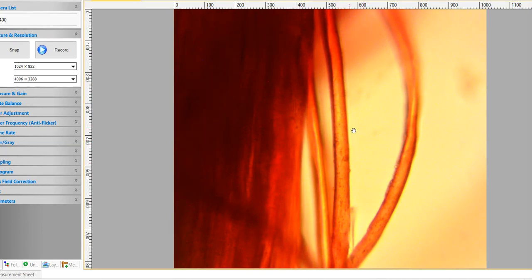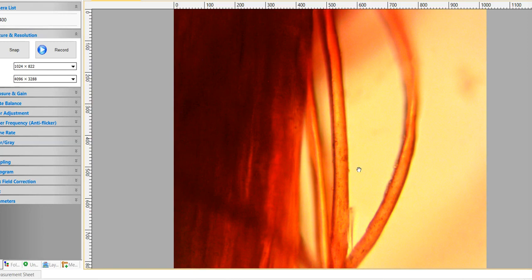And I believe, let's see what it says. What is this thread? It is polyester. Guess what polyester is? Polyester is plastic. So because it is plastic, it's smooth. You got some nice smooth threads here. If this were cotton thread or something like that, it would be a little more rough and things like that.